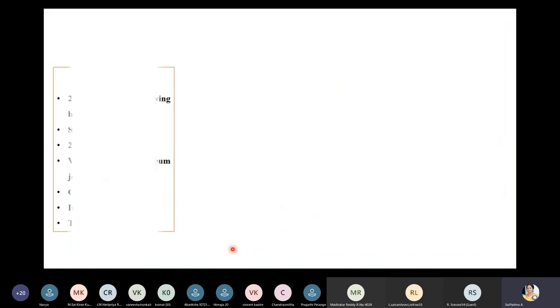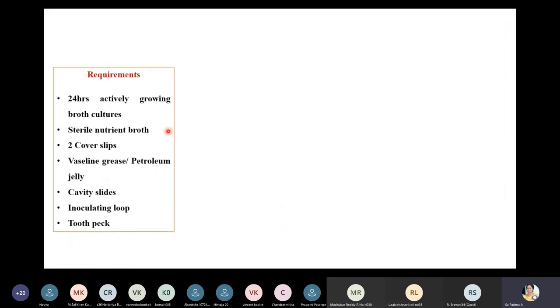The basic requirements for the hanging drop method to determine motility of bacterial cells are: 24-hour actively growing broth cultures, sterile nutrient broth, two cover slips, Vaseline grease or petroleum jelly, cavity slides, inoculating loops, and a toothpick.